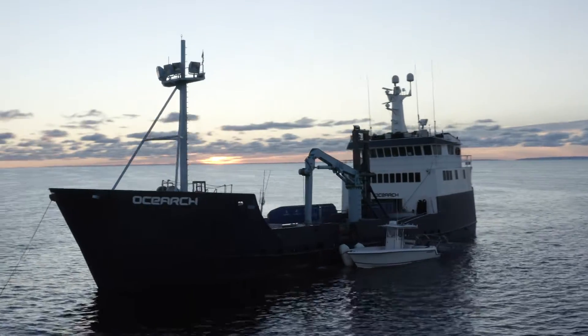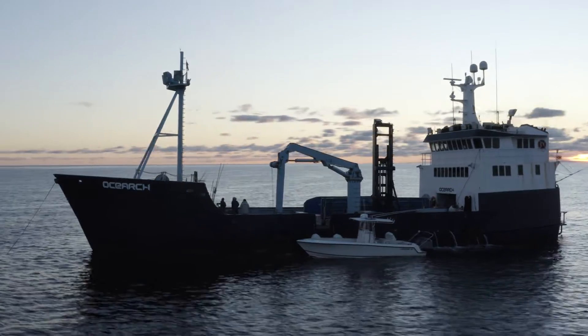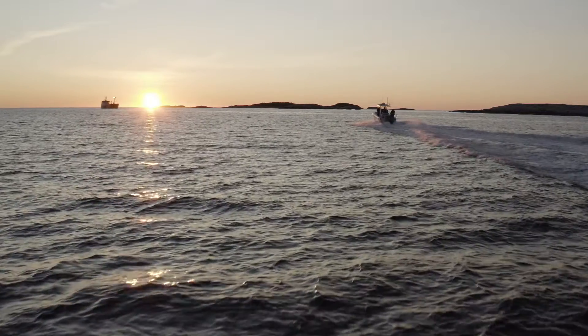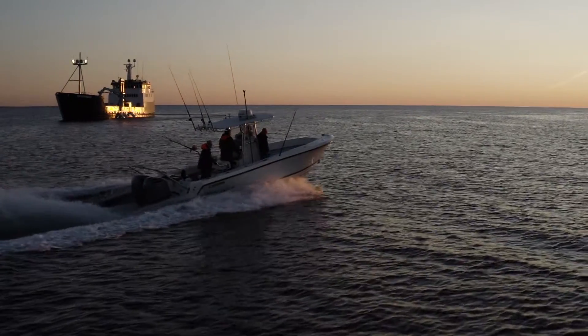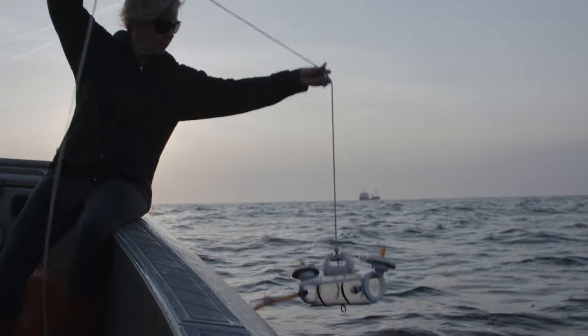We're out here on OCEARCH and we're using a technique called eDNA, which is environmental DNA. This is a technique that we're using to be able to determine whether or not we have a specific shark in an area.